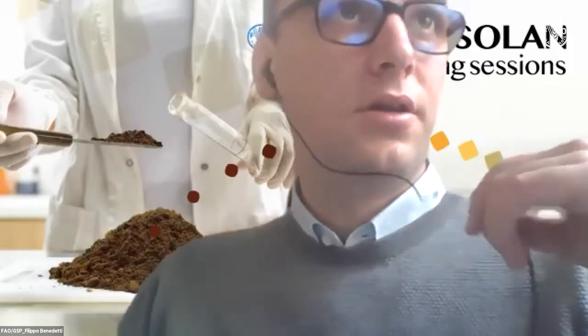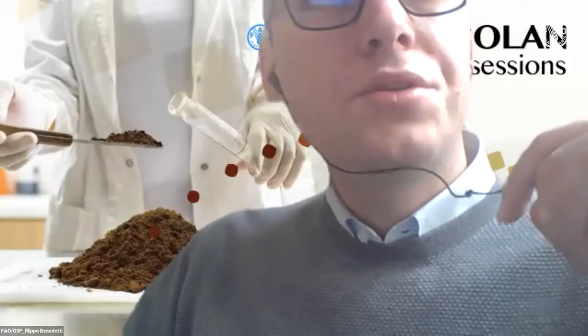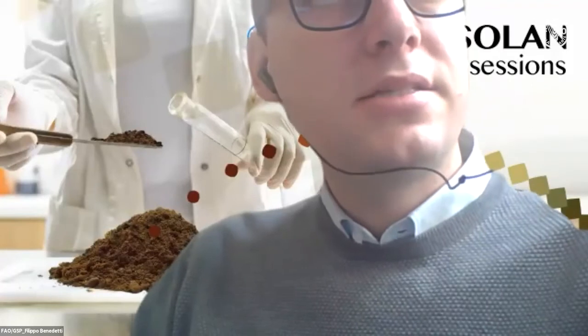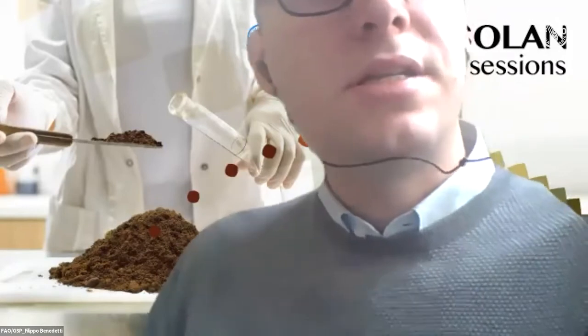Another question was about sandy soils. They say in sandy soil, with saturated paste, usually water floats at the surface, which is confusing as to whether the paste is oversaturated, but this is not the case. So how do we confirm that the saturated paste of sandy soil is ready for extraction? Yes, we should make sure about this point, because there are differences between sandy soils and clay soils. But I think it's very important that we don't use this saturated paste in this way.